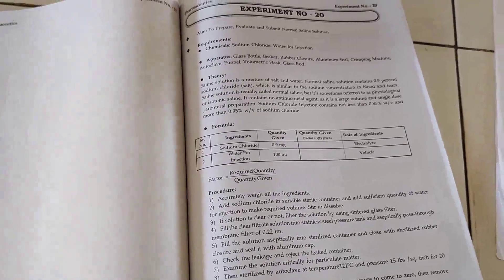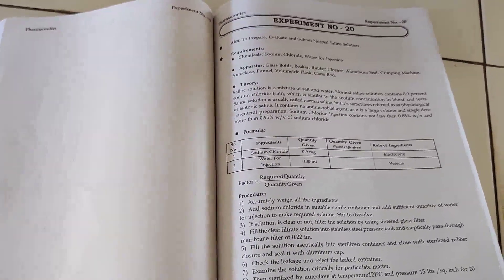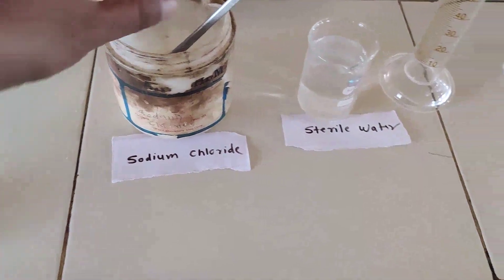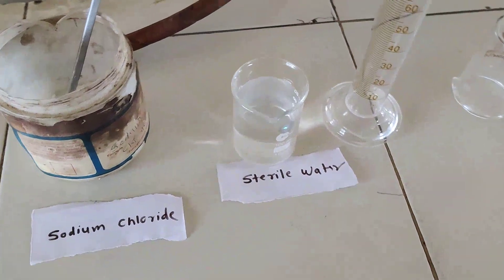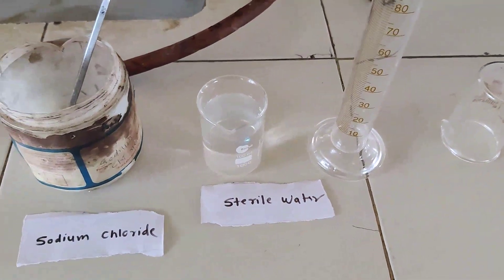The aim of today's experiment is to prepare, evaluate, and submit two ampules, each containing 10 ml normal saline solution. Normal saline solution is also called sodium chloride injection. Ingredients required for this experiment are sodium chloride powder and sterile water for injection IP.